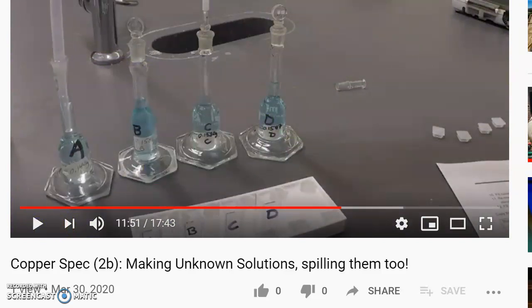So here's all of our solutions. Notice and take observations of what these solutions look like. And it's interesting that they're all pale blue, right? That's the copper. So all of these solutions liberated copper ions into the solution, and that's what the spectrophotometer is picking up on, okay? So that copper is absorbing the light of the certain wavelength, and since it's absorbing it, the detector on the other side is not picking up that light.